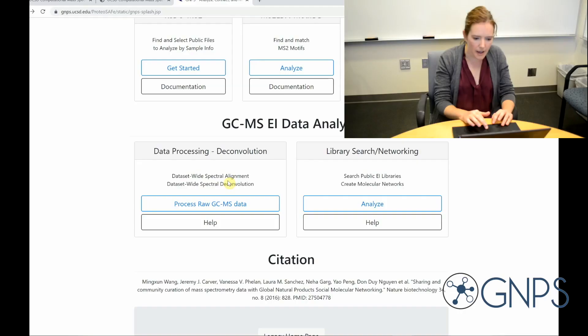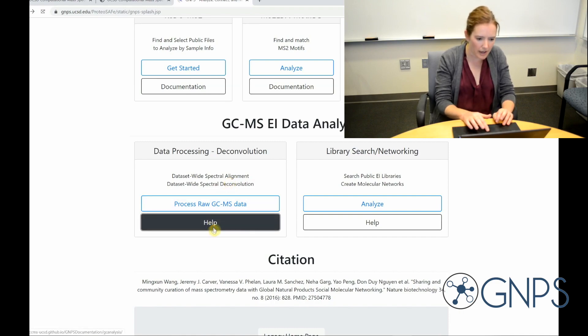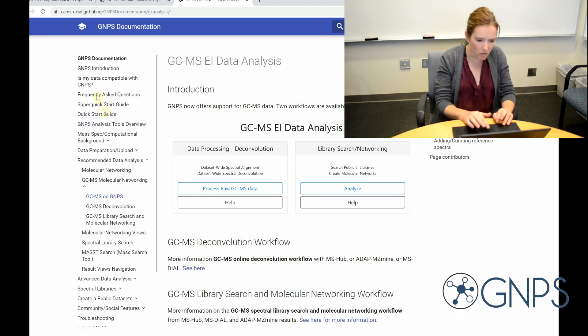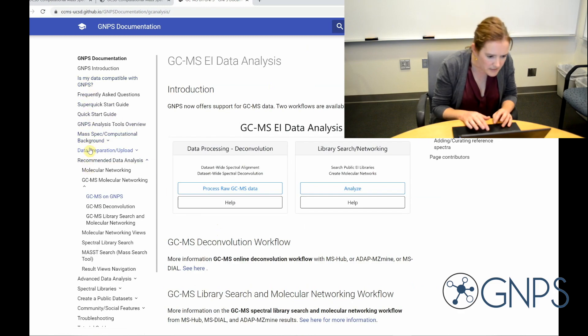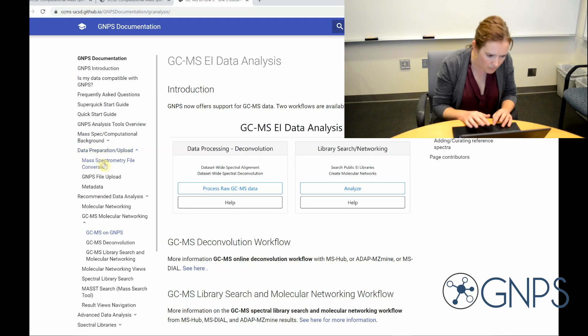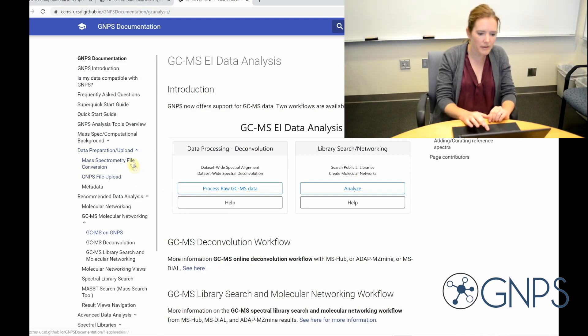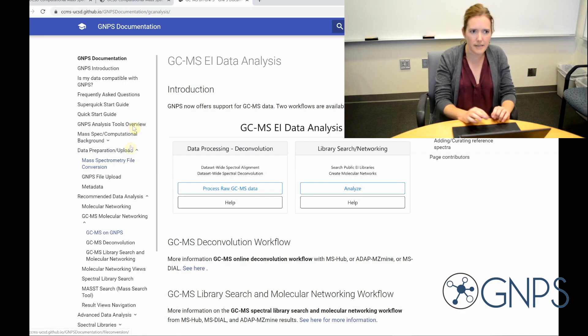The first step is to convert your files to mzml or cdf file formats and upload them to Massive on GNPS. So to do that, we have tutorials on our website. If you click on help and then go over here on the left, you can see there's a data upload preparation upload tab, and then you can find the instructions here. So we're not going to show that step.